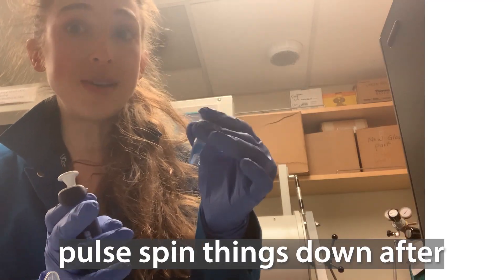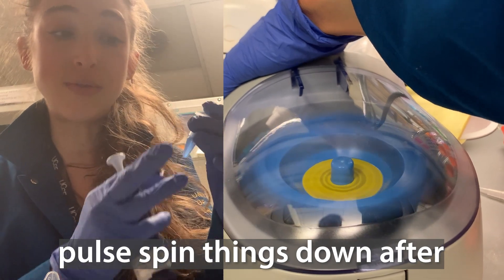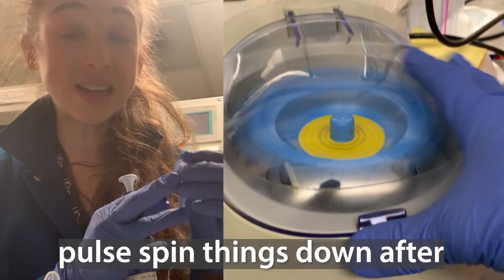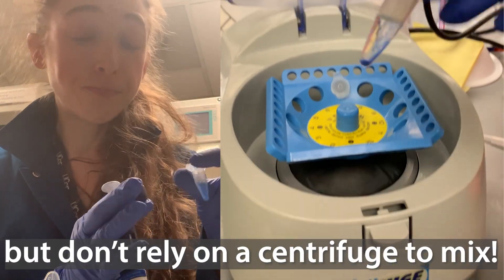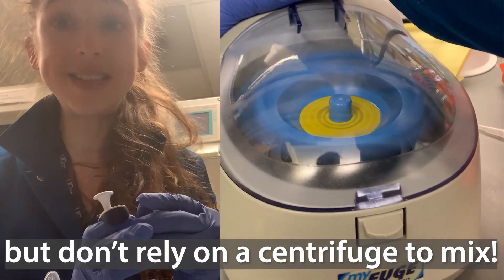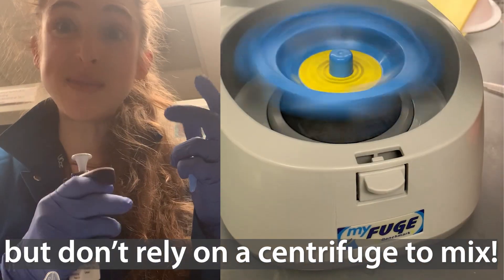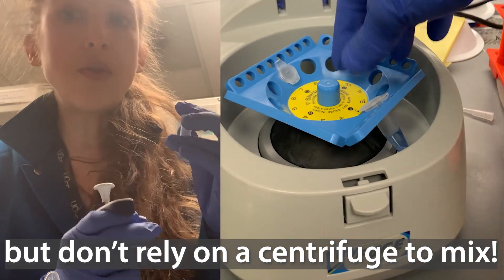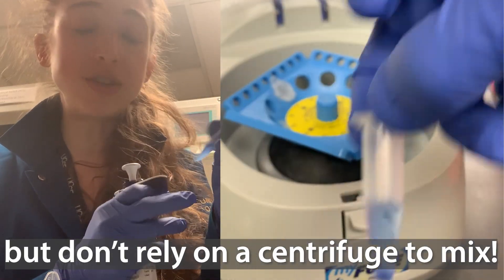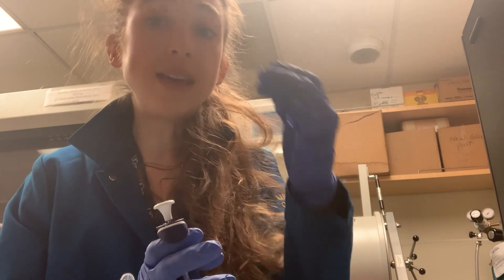No matter what method you use to mix things, you then want to give it a little pulse centrifugation to make sure that if you had stuff on the walls, it gets pulled down. You don't want to just rely on that pulse centrifugation to mix things, because the centrifuge is just spinning — it's not actually mixing things up and down. So by doing your finger vortex, by doing your pipette mixing, all these things are helping you get a thoroughly, completely mixed solution.